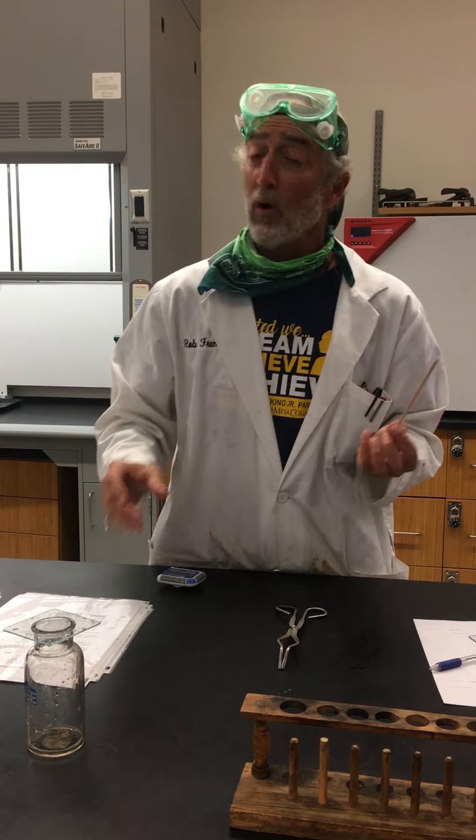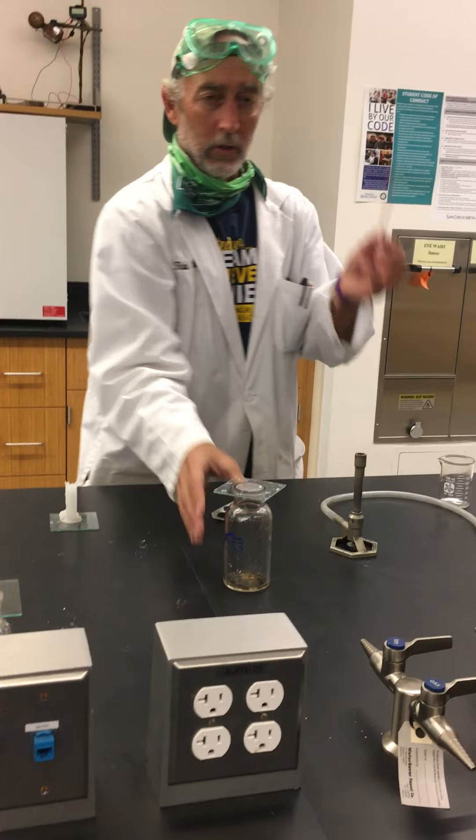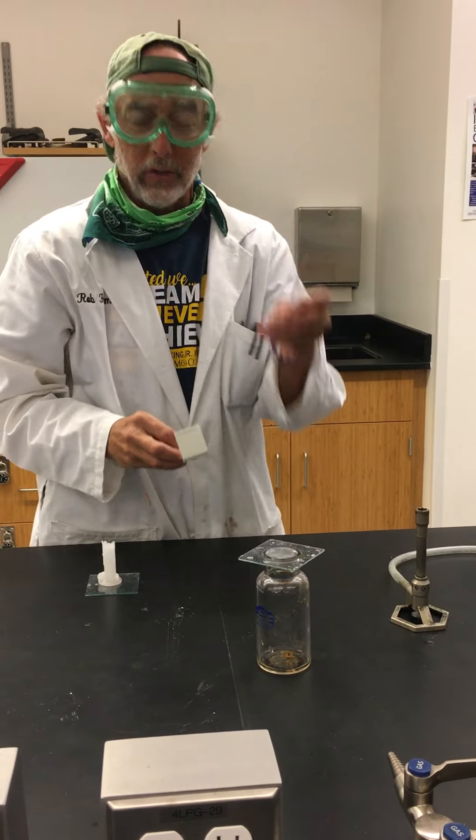So a test for oxygen gas is just that. This is a bottle of oxygen. So what I'm going to do is take a piece of wood, a splint — as we say in chemistry, but most people say popsicle stick.